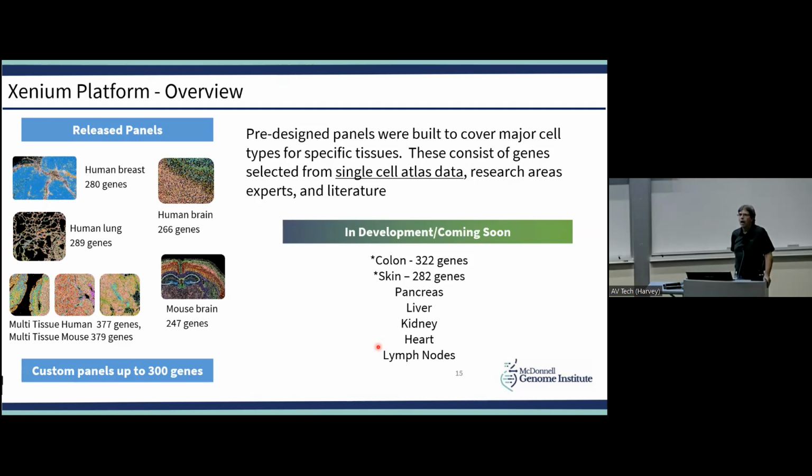But when you get down underneath it, they really like to find things that have worked well in the single cell or Visium space, because those have a really high probability of working. Probes around those transcripts have a higher probability of working in the Xenium space.